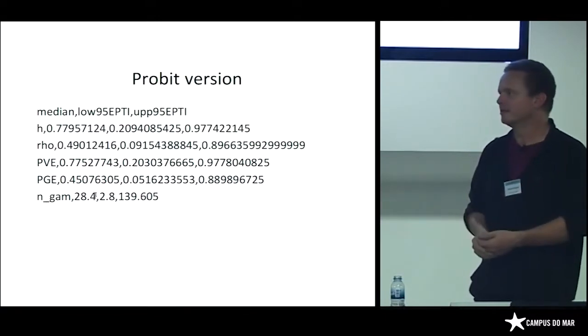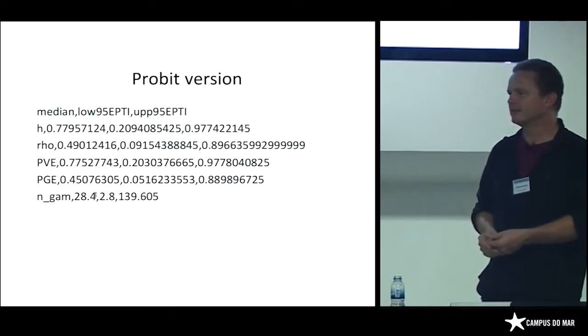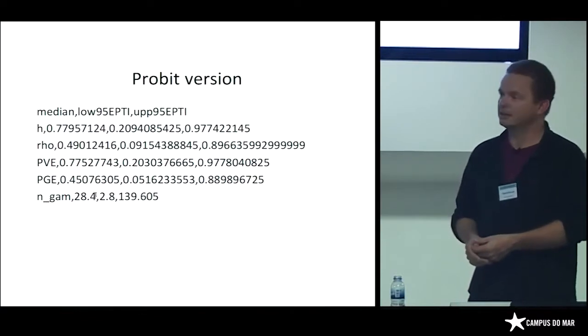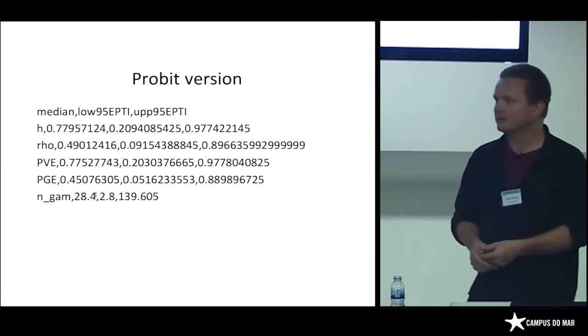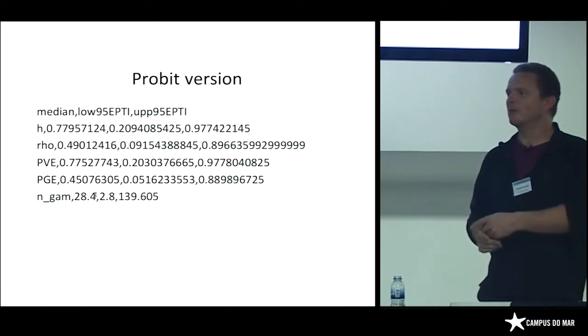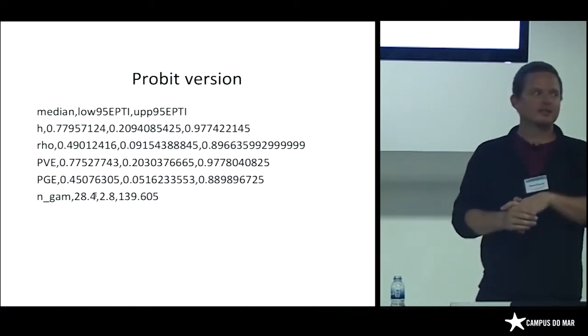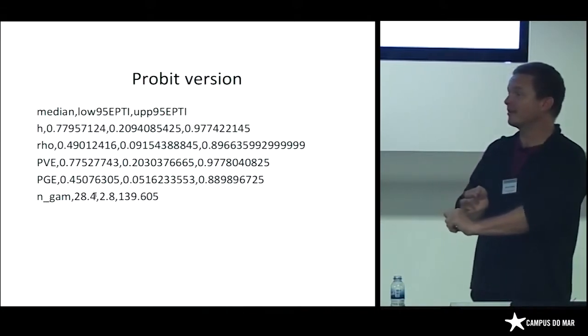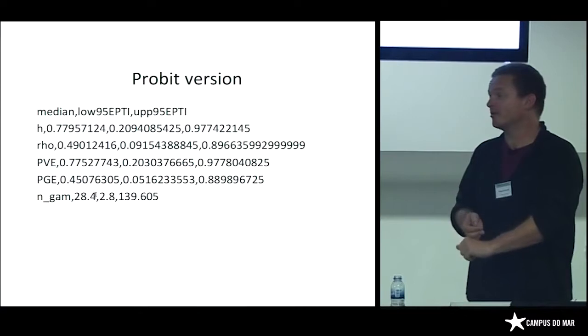To know something about population structure estimate. Yeah, I'm interested in association. So more association studies, structure. So we've still got mapping and SNP calling. Everybody confident that they can just do that, or do you want to go through that?